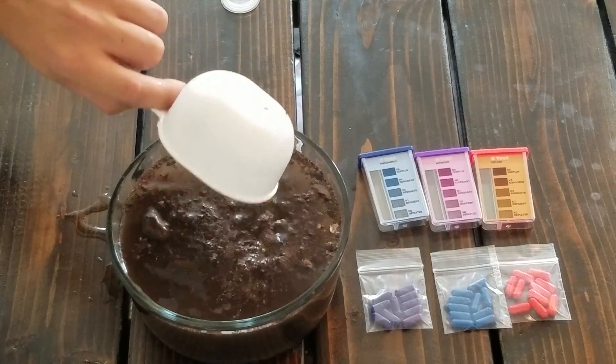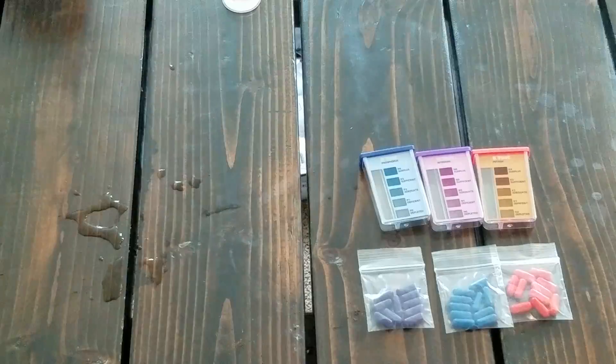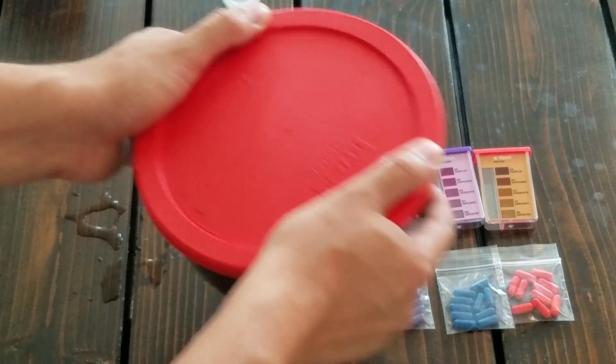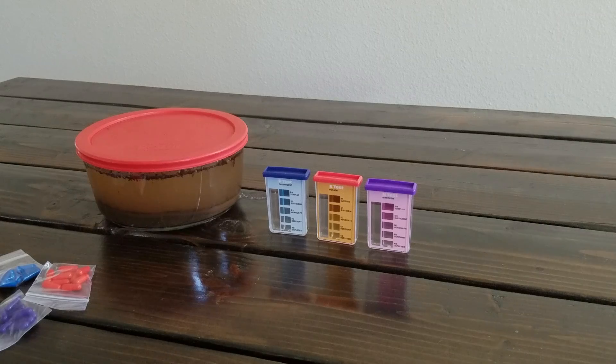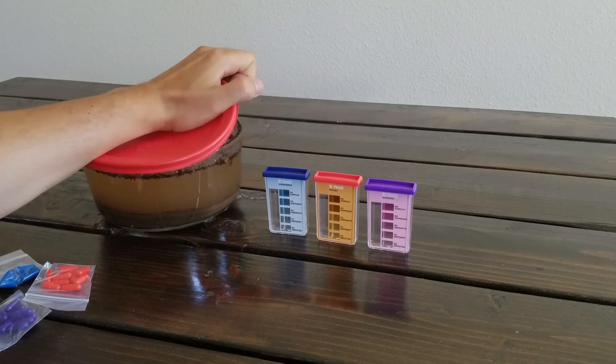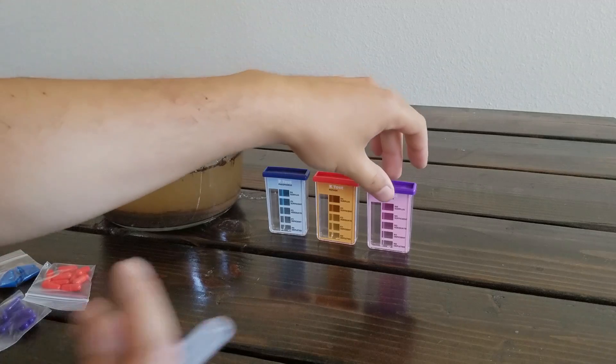I set the time-lapse up for about an hour or so, but by the time I came back it was still really cloudy, so I let this go overnight so the soil could settle out. It took a lot longer than I thought, but that's okay. Now we're here at the next step.